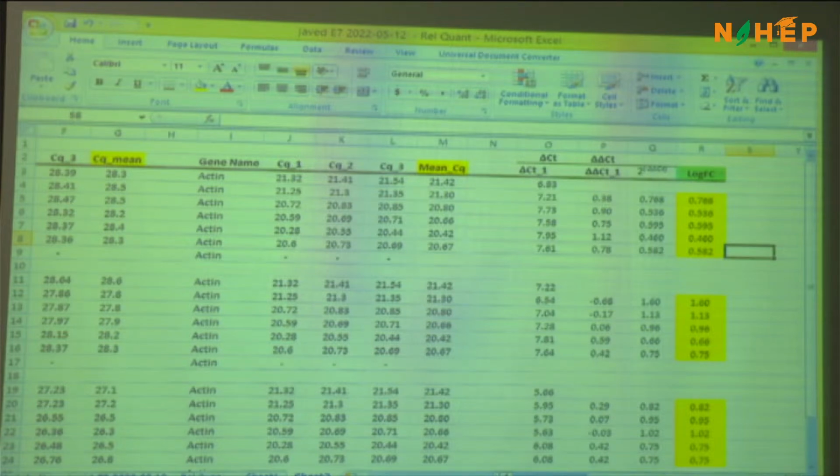But the problem is, our gene of interest is not expressing in the untreated condition, and is expressing in the treated condition, but it is lower than the target, meaning the reference gene. So will it be considered as downregulated? Sure, yes. Even if it is expressing in the treatment, you get expression everywhere, but how much expression there was is what you have to calculate.